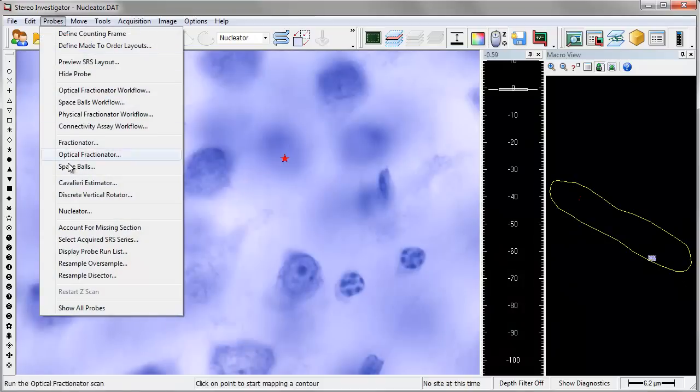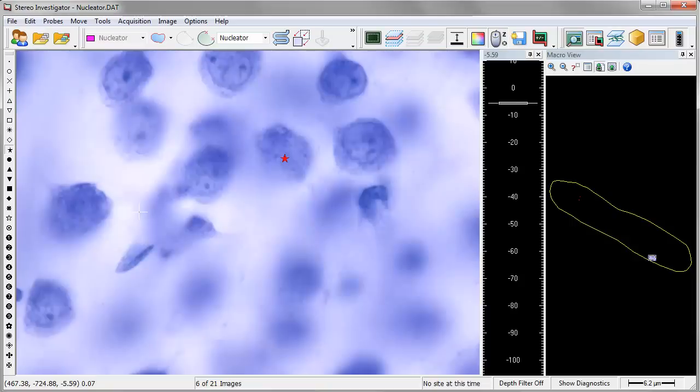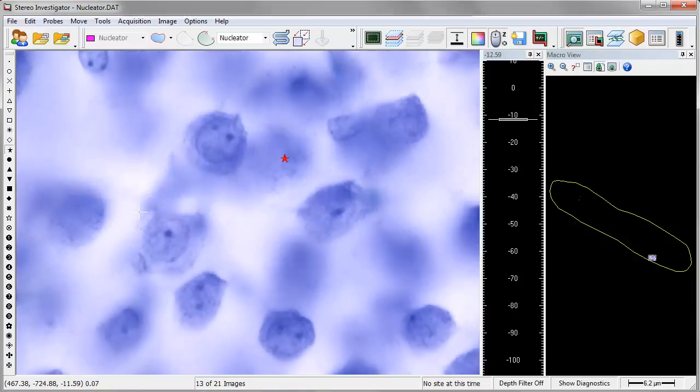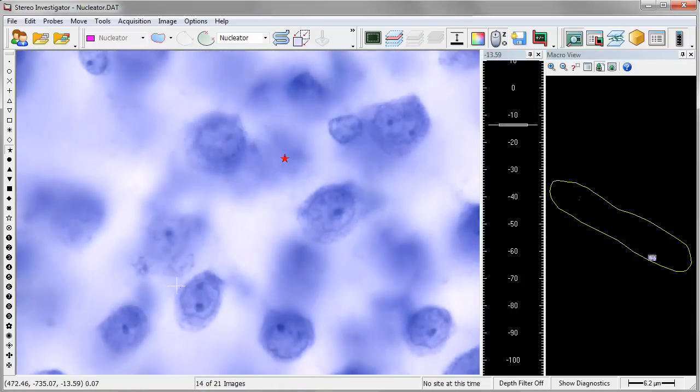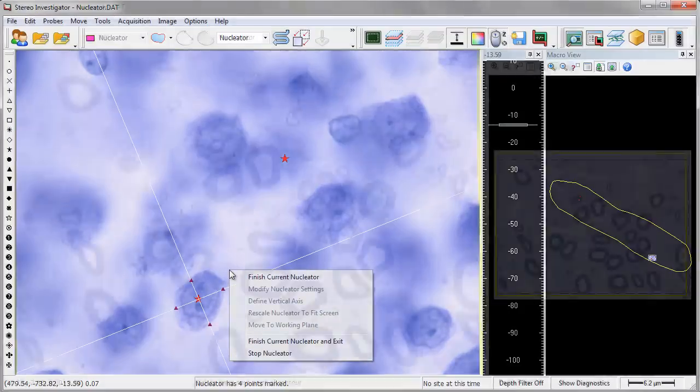The nucleator probe is used to estimate the mean cross-sectional area and the volume of objects, such as cells in isotropic uniform random sections or vertical sections. Normally used within the optical fractionator or another systematic random sampling scheme, this probe identifies the cells that need to be sampled.